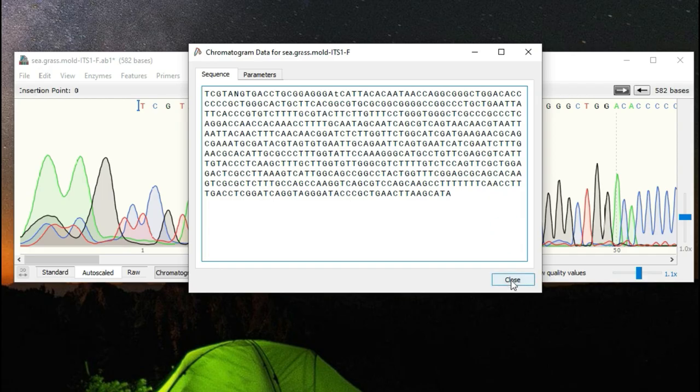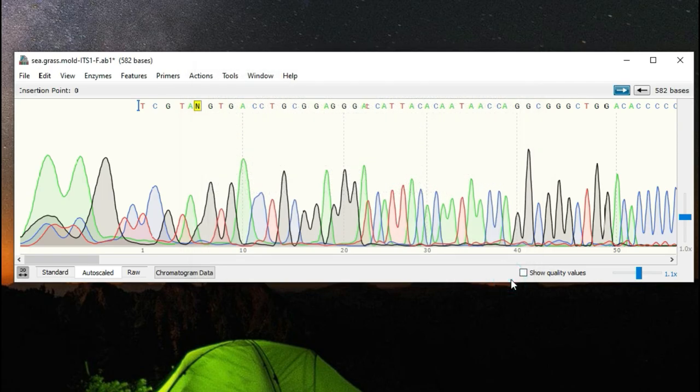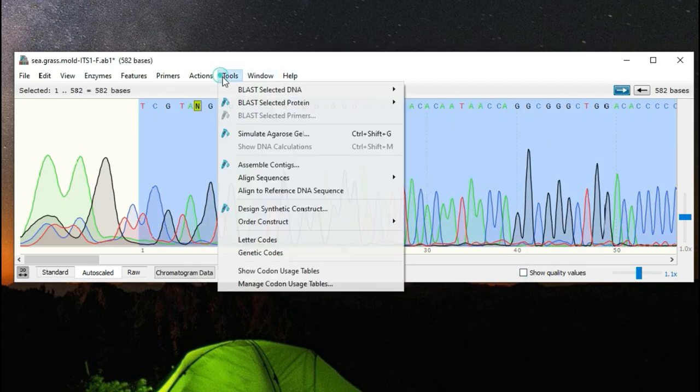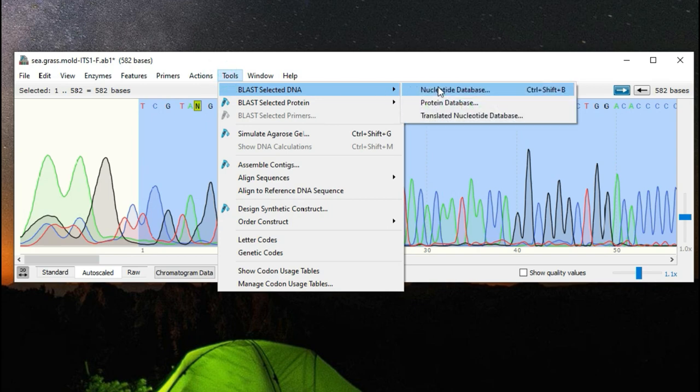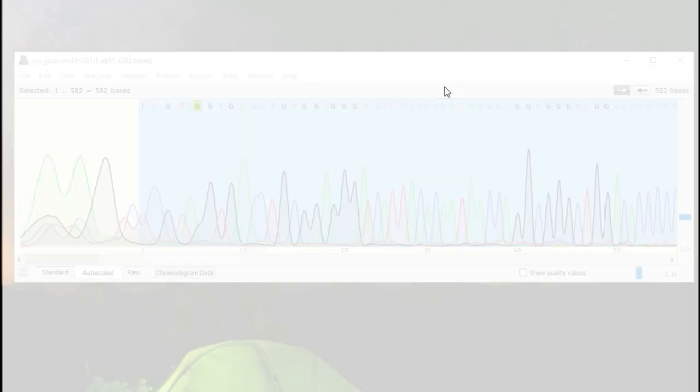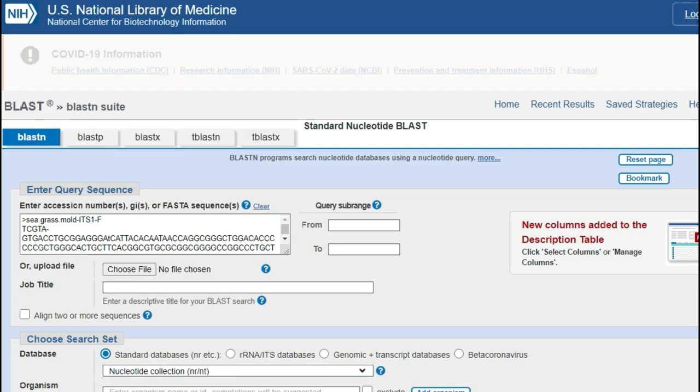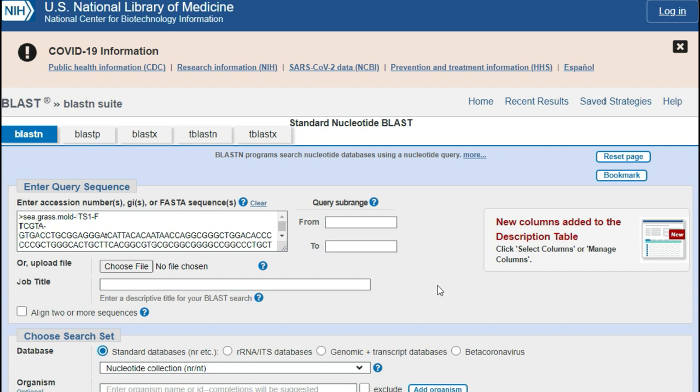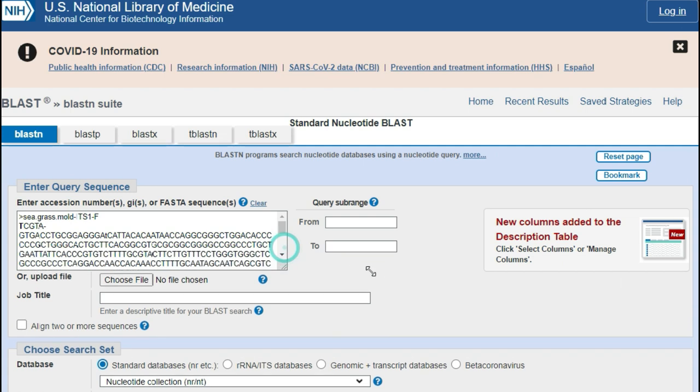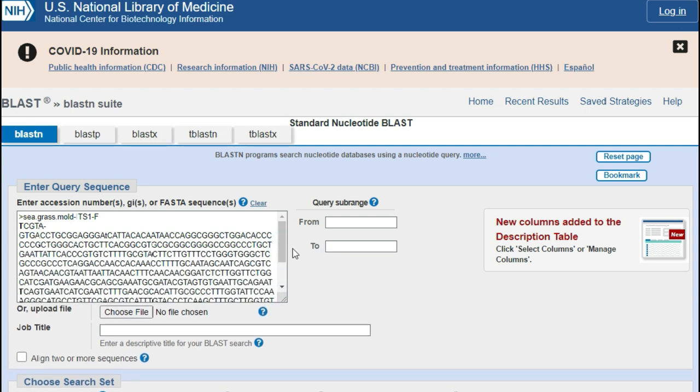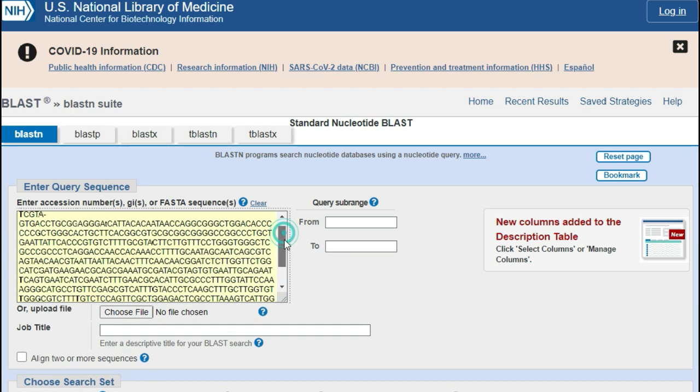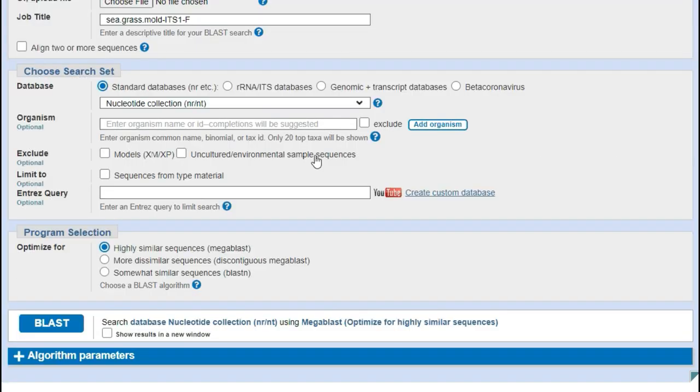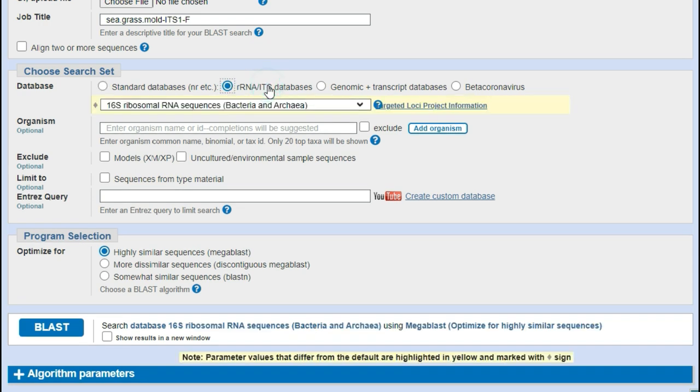All right let's start the fun part. Once we've made an initial first pass at cleaning things up we can select the sequence go to tools in the menu and select blast. This will post the selected sequence to the blast tool on the genbank website.